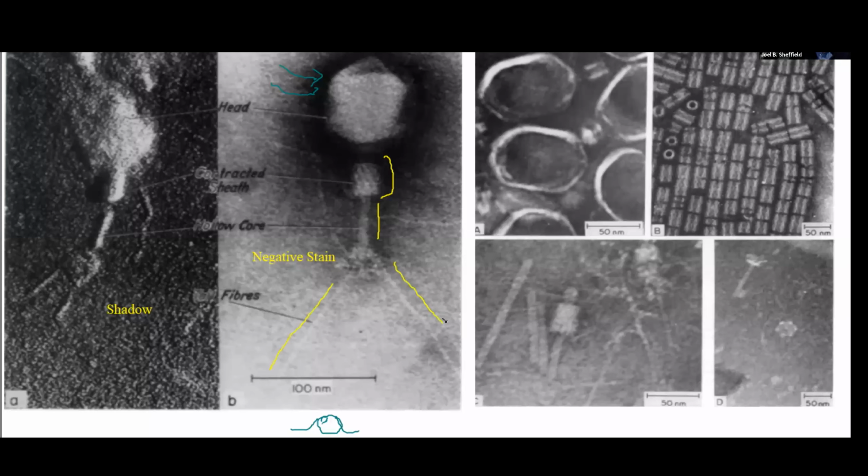So you could get quite a bit of detail out. And they showed that if you can fractionate this virus into its subparts. So here's the head, here's the sheath, okay? Here's this entire piece with the tail attached to it, and here are the attachment points. You could really check your isolation by looking at the morphology of what you got.